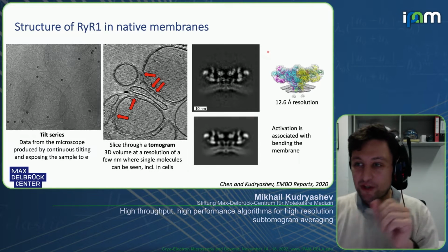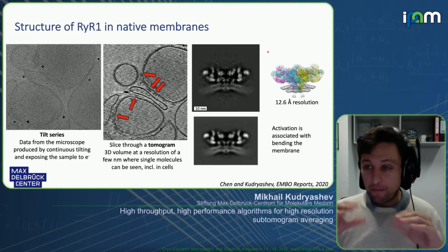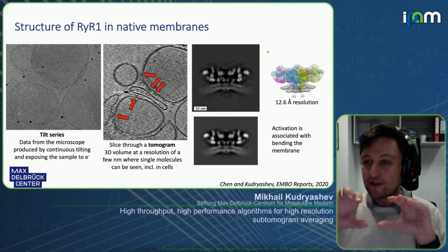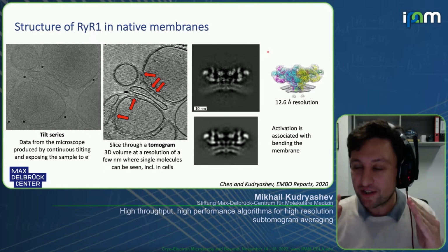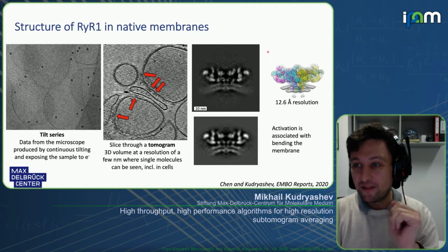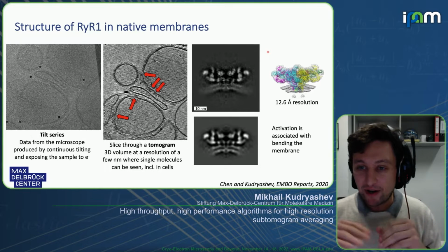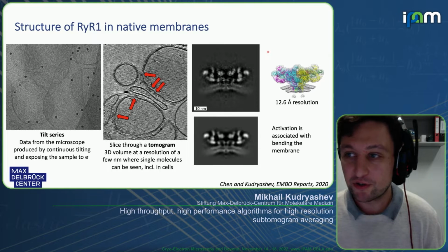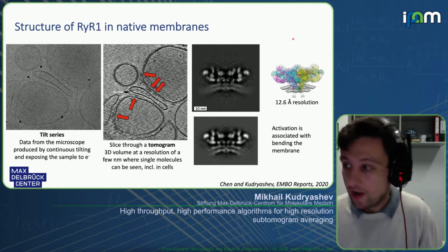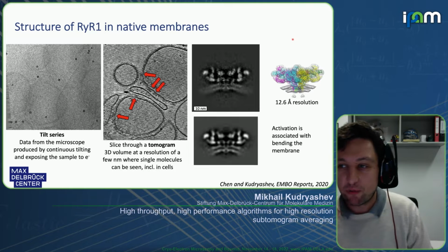And we see that while the outer domains move similarly to the structures when they're purified, the membrane is also deformed. This is interesting and non-trivial, and it means that once the receptor is open, there is some amount of elastic energy stored in the membrane. The membrane would obviously want to bend back, and it would probably favor closing of the receptor a little bit faster than if there were no membrane.